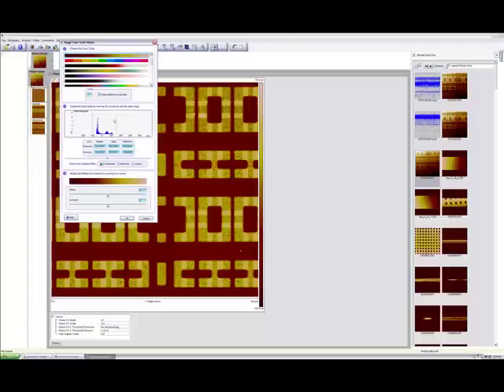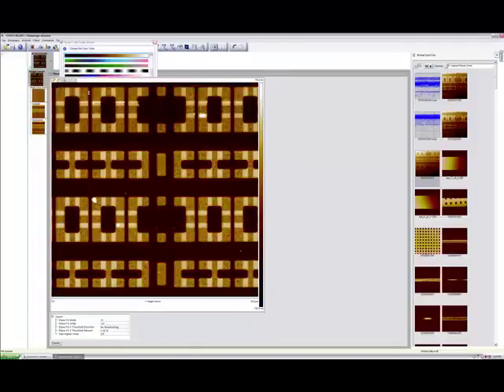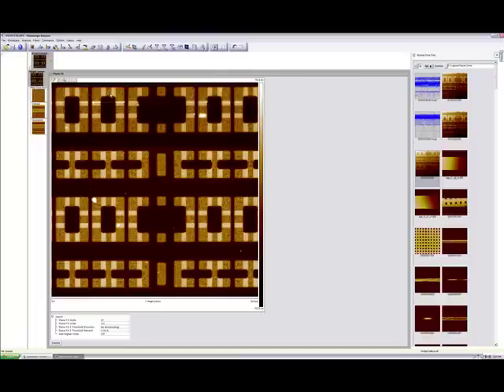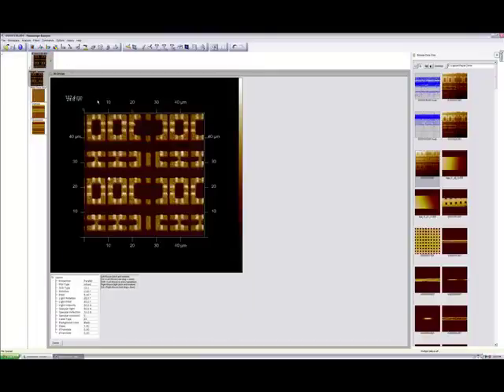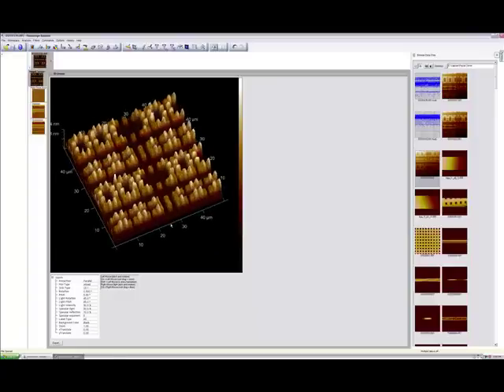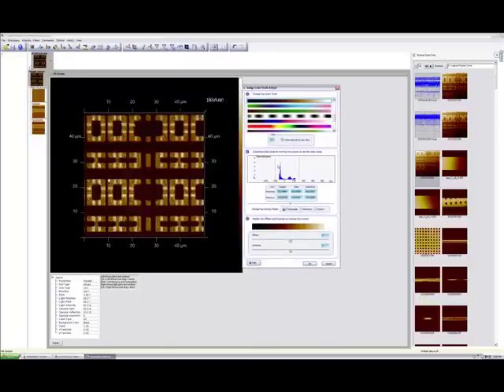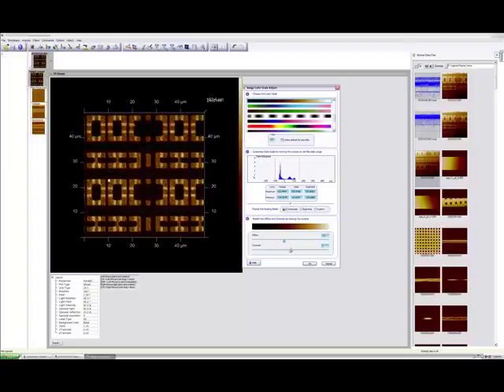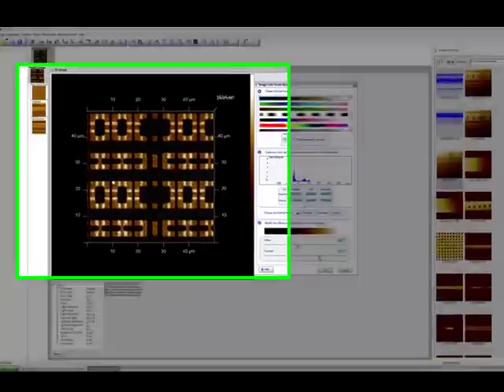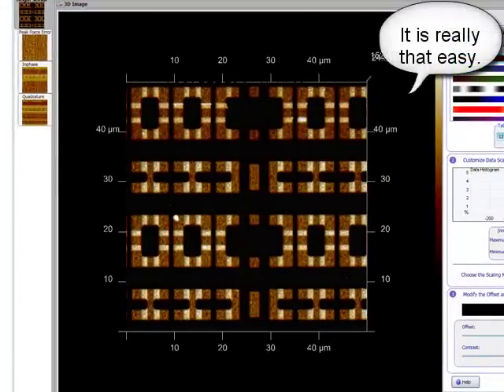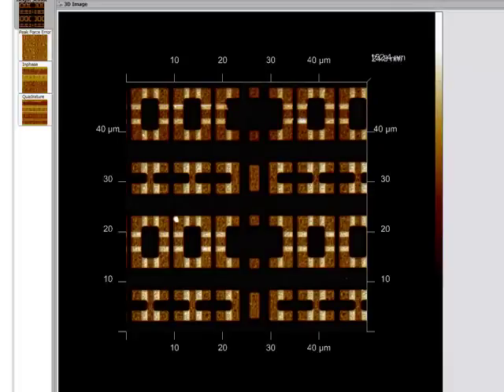Now we go to the 3D display. We can change the color scale by right-clicking on the color bar and adjust to the more familiar Table 12. Then we display it in three dimensions with an artificial light source. We can change the orientation using the mouse or by typing in the appropriate viewing parameters, and adjust the histogram. And then we are done — it is really that easy. Go ahead, try it and have fun. Thank you.